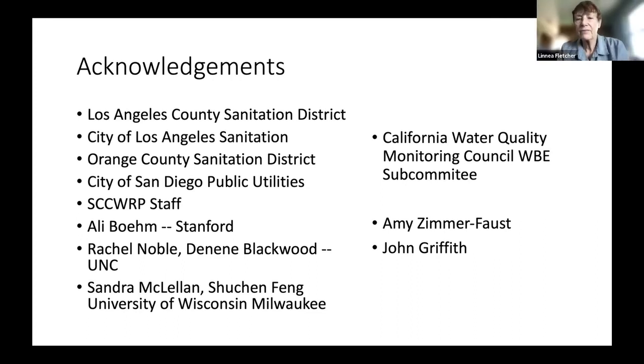Could I ask a quick follow-up, Yolanda, on that one before he leaves that? Have they determined the sensitivity for large volume concentration qPCR with DNA standards, so they know how sensitive it is? They do spike controls two different ways: a spike-in control with an RNA virus and with RNA itself. And then, yes, they do still run a standard curve.